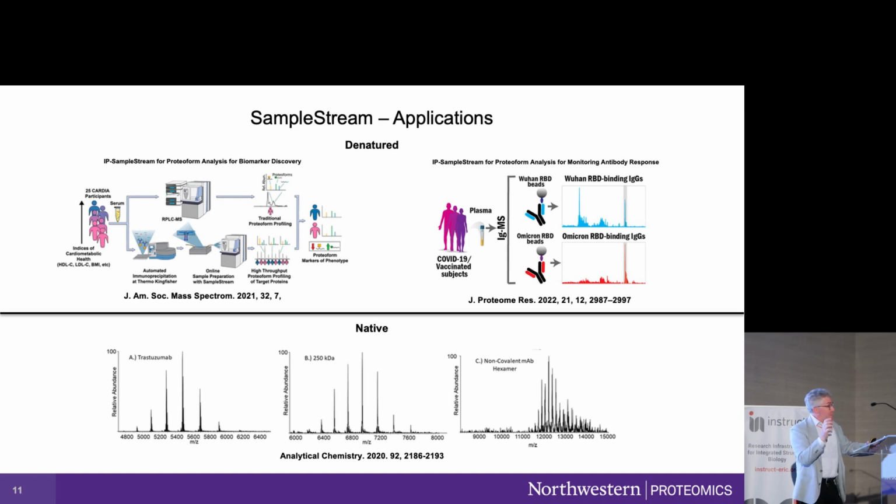because of the way that this new mass spec works, you can get single clone resolution. You can get the individual IgGs, and there's distinct proteoforms that bind. That's a new level of specificity, and we don't quite know what to do with it in the world of serology yet, but it is a technological boost.